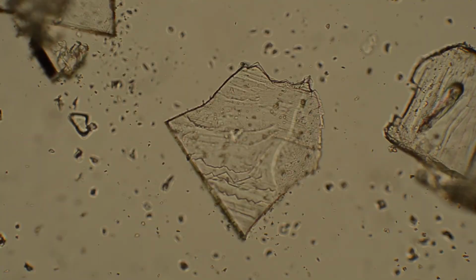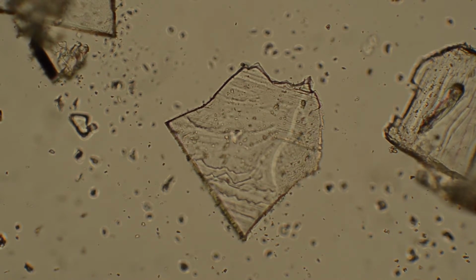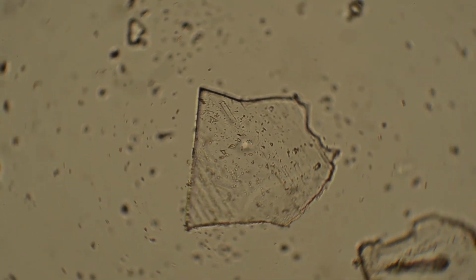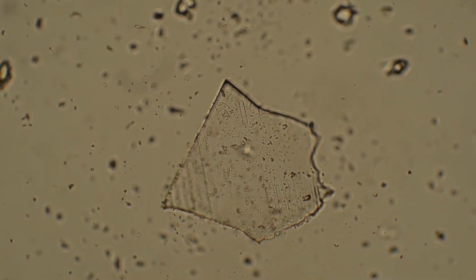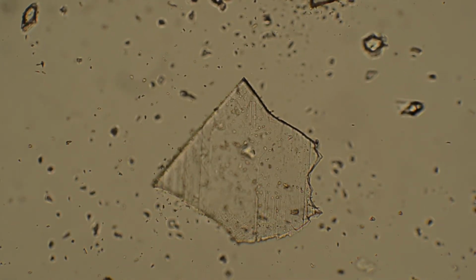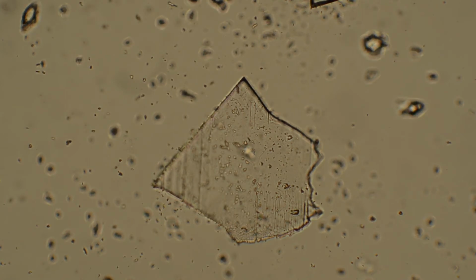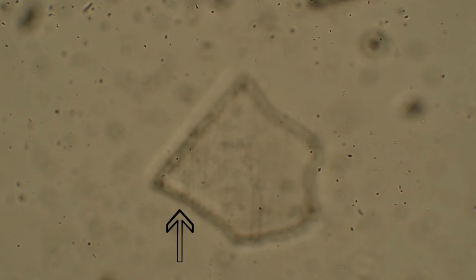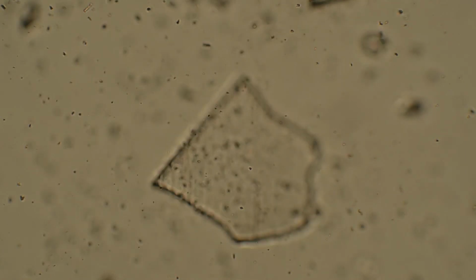Some minerals display different relief along different planes. In this grain mount, we are looking at the center mineral. Here, as I rotate the stage, the border changes from faint to distinct, showing a range from medium to high relief. What we can also see is the Becke line moving in and out of the mineral at the same time. Notice that at the top it moves out, while at the bottom it moves in. In this mineral, light behaves differently depending on orientation. This property is known as anisotropy and will be explored in the following modules.